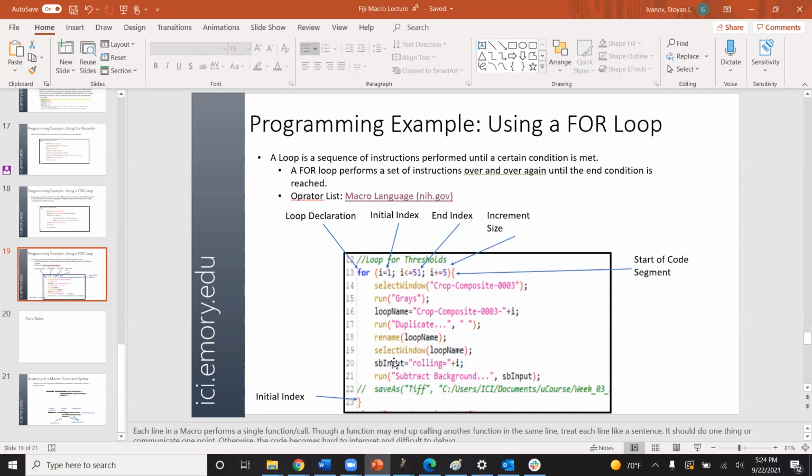Okay. So this is super cool. I do have a question on this. Yeah, go on. When you use the, I got the point that i equals 1 is where you want to start from, i equals 51 is how far you want to go, and you want to go at increments of 5.